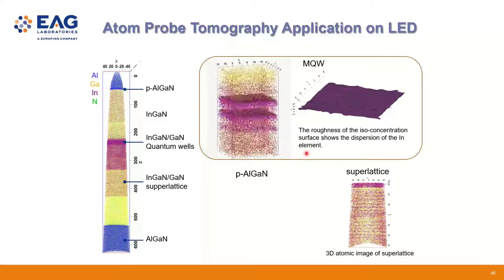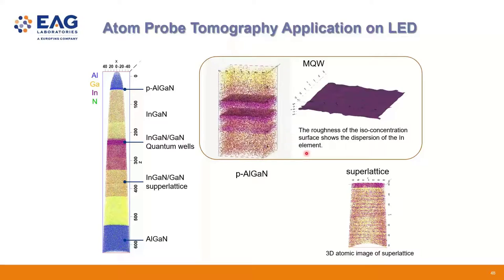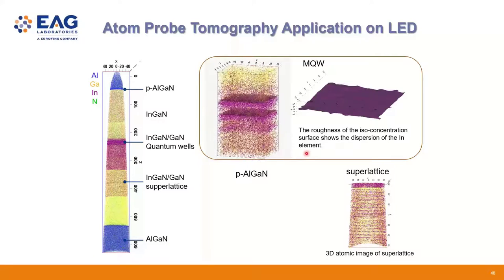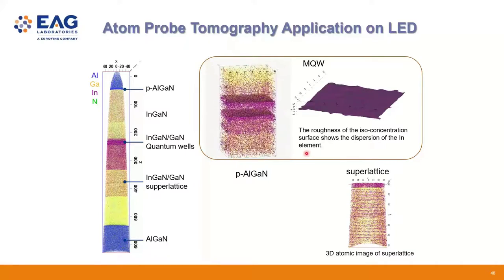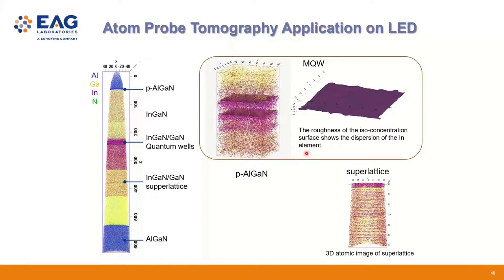Excellent. One question I was curious about here is, if you had one of these samples in the TEM, just based on the geometry and the size, how practical is it to do something like tilt to a zone axis for something that small? Is it a super small sample, or with a modern stage, is that actually achievable?